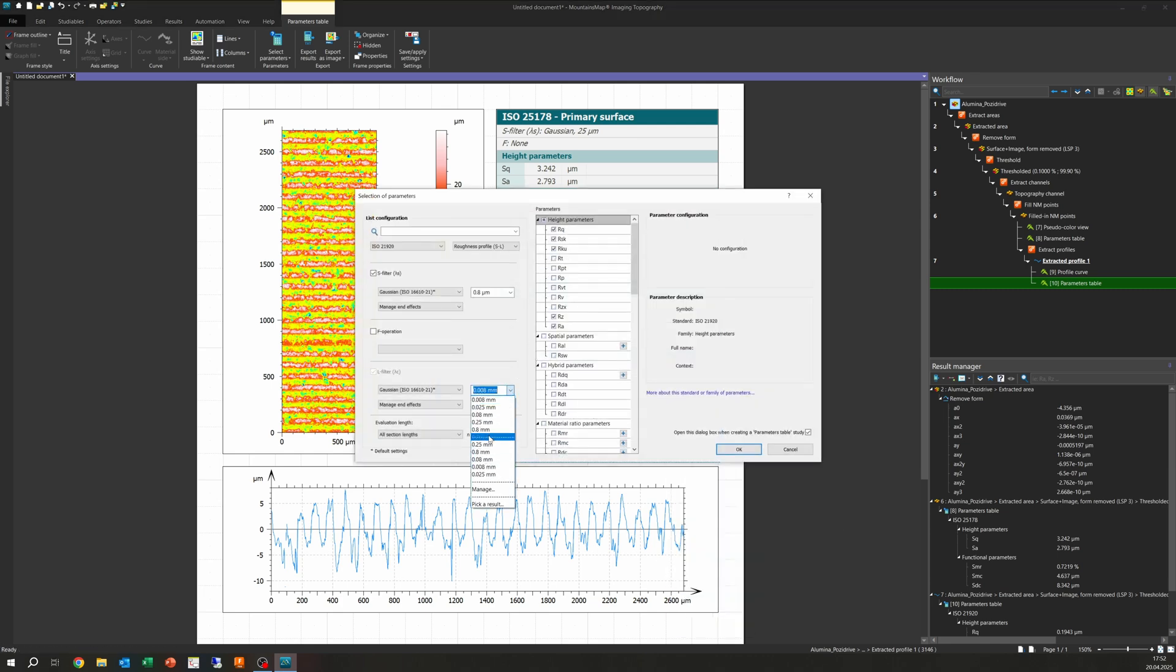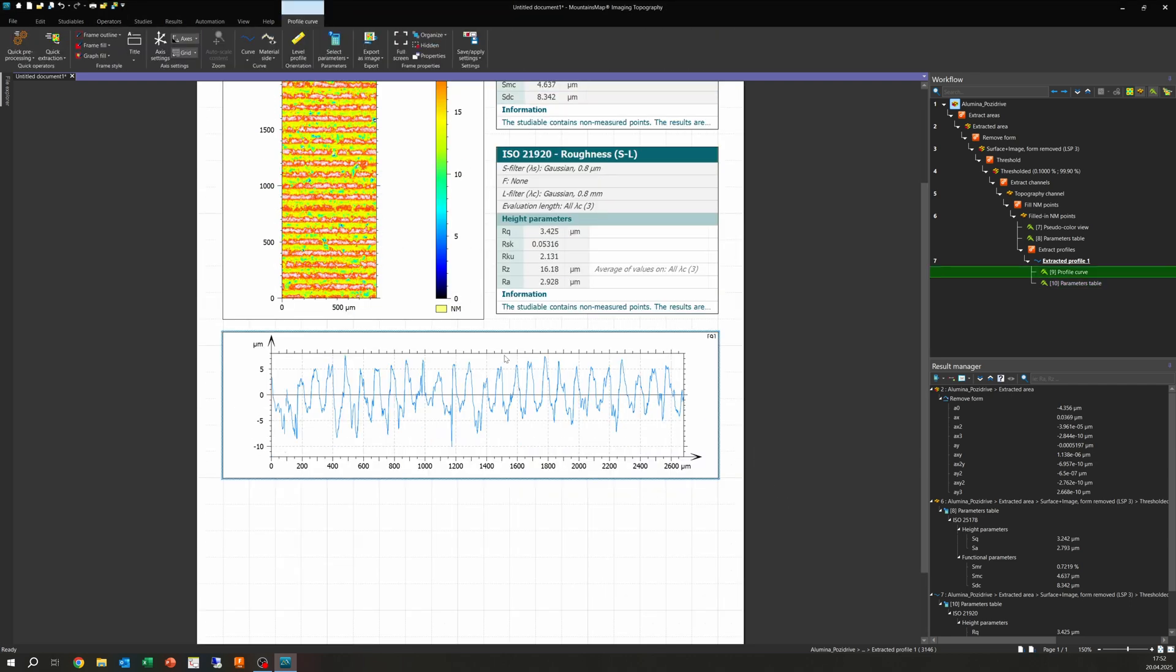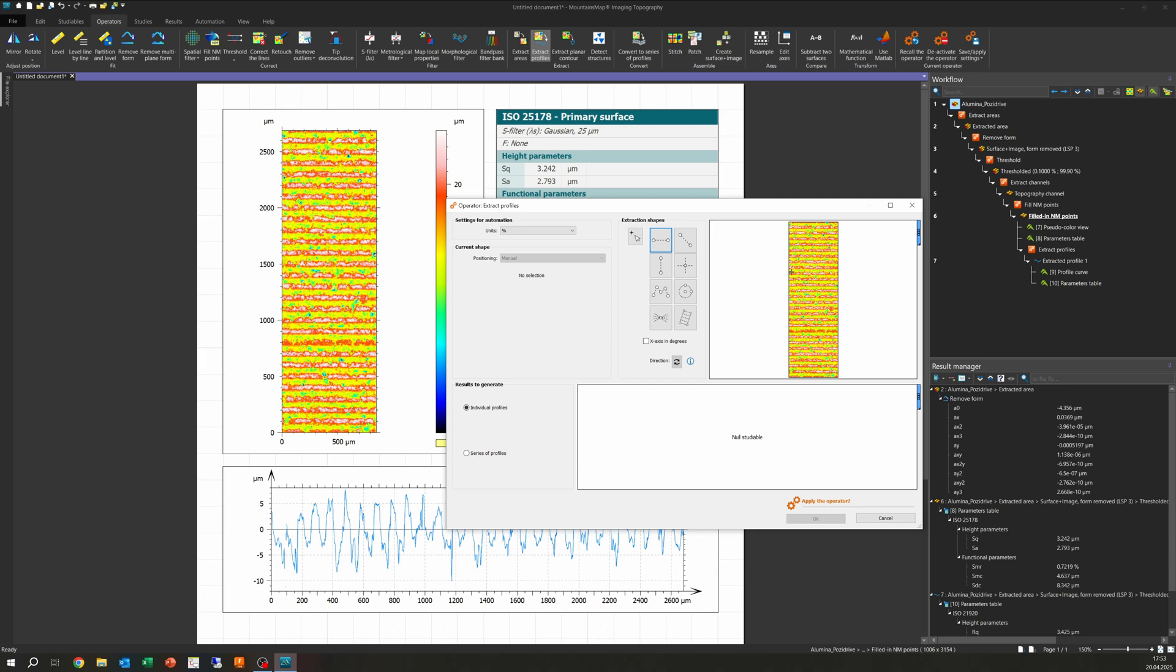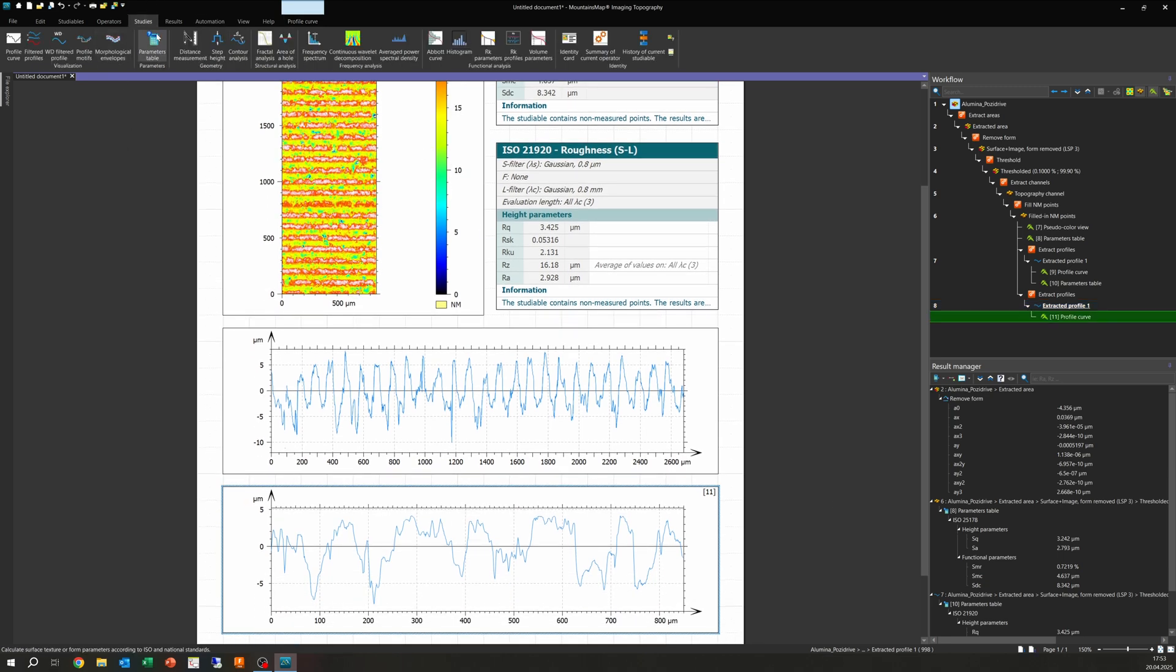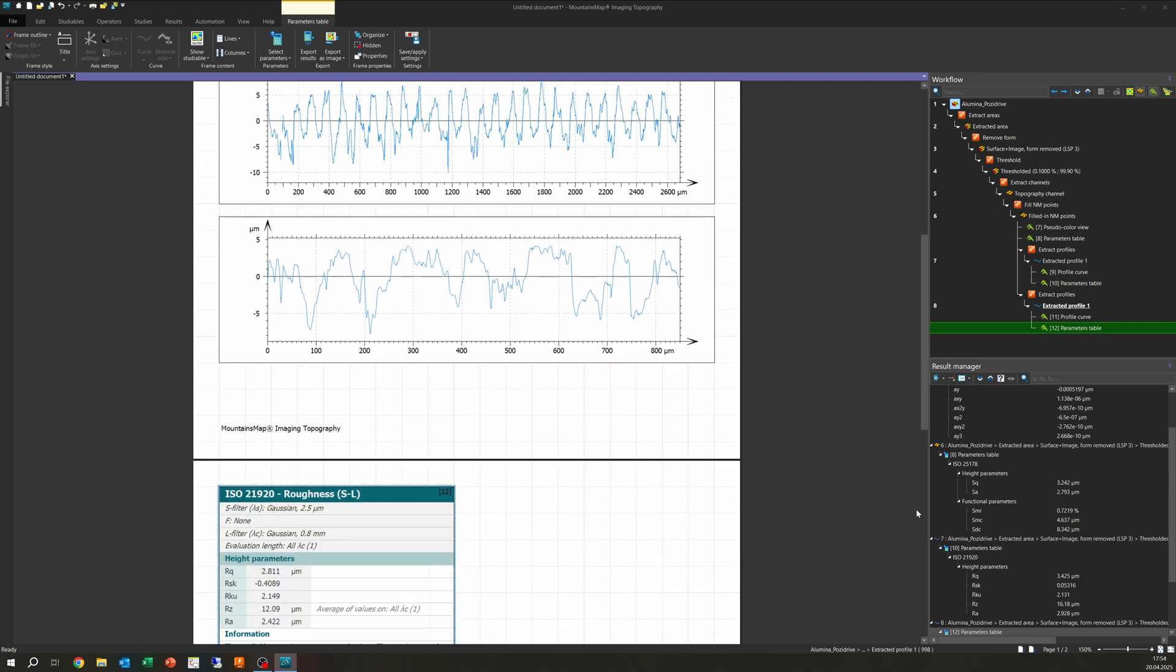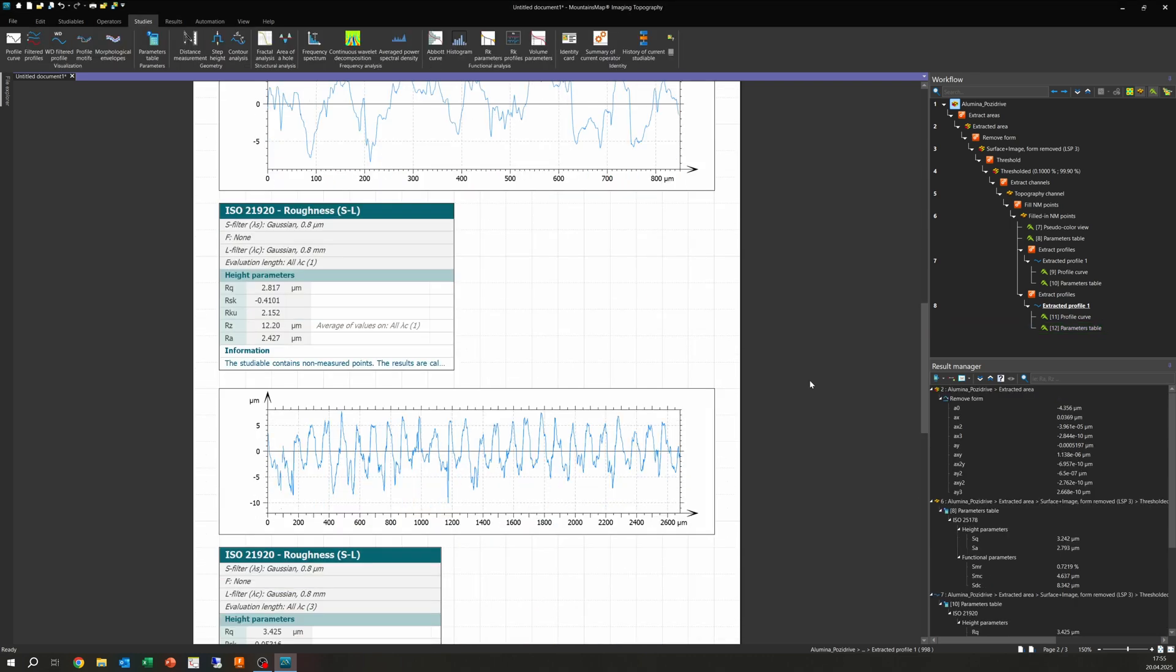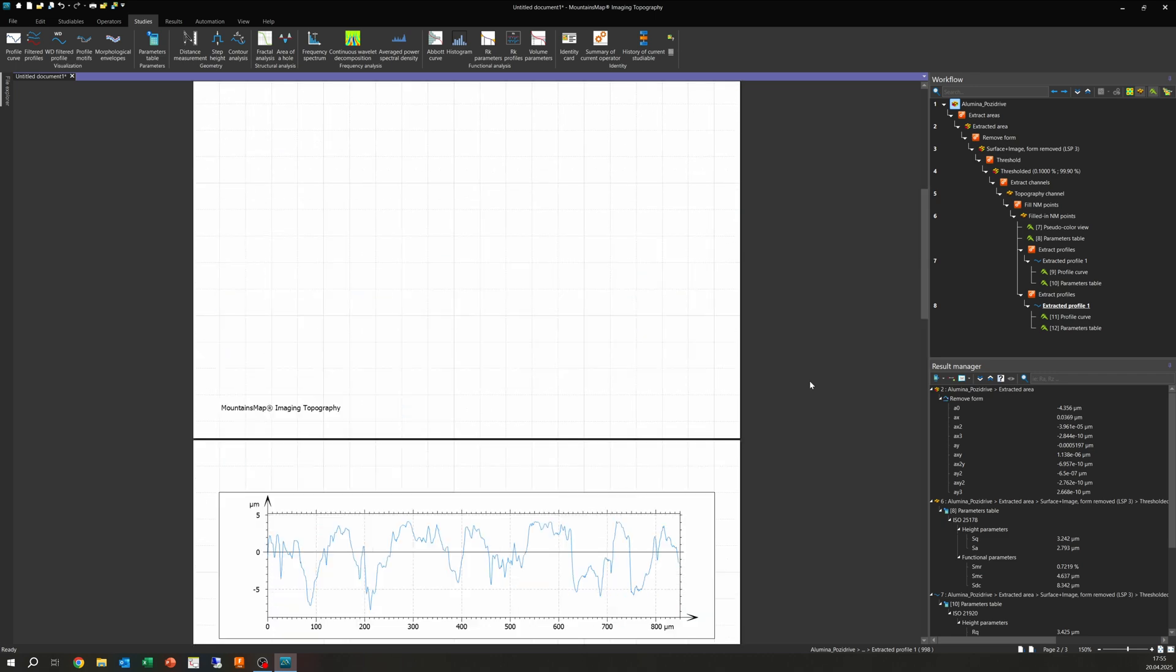I'm resetting the filters to a more realistic value of 0.8 millimeters here. Line surface roughness is also super dependent on the direction. The ISO standard quite clearly states that you have to measure perpendicular to your stepover direction. Here, this would be the north-south profile. The not only much shorter east-west profile doesn't pick up on the kinematic surface roughness resulting from the stepover. I'm arranging the two profiles down below here so we can compare the RA values. And you can see on the short profile, we have 2.4 micrometers, whereas on the long profile, we have 2.9 micrometers. This is a difference of 20%, so not really a very robust measurement if you always need to know and align the direction of your profile. Maybe it shows why I like aerial surface parameters so much.